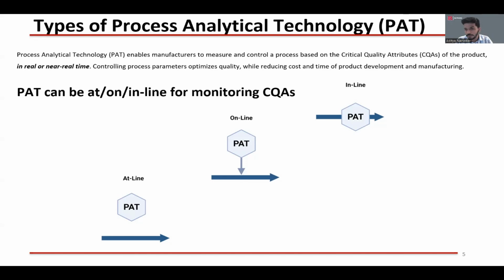Further moving on to the inline part. In the inline part, the process analytical technology tool is in line, as the name suggests, with the process that is happening, which means that the measurement is in contact with the process.